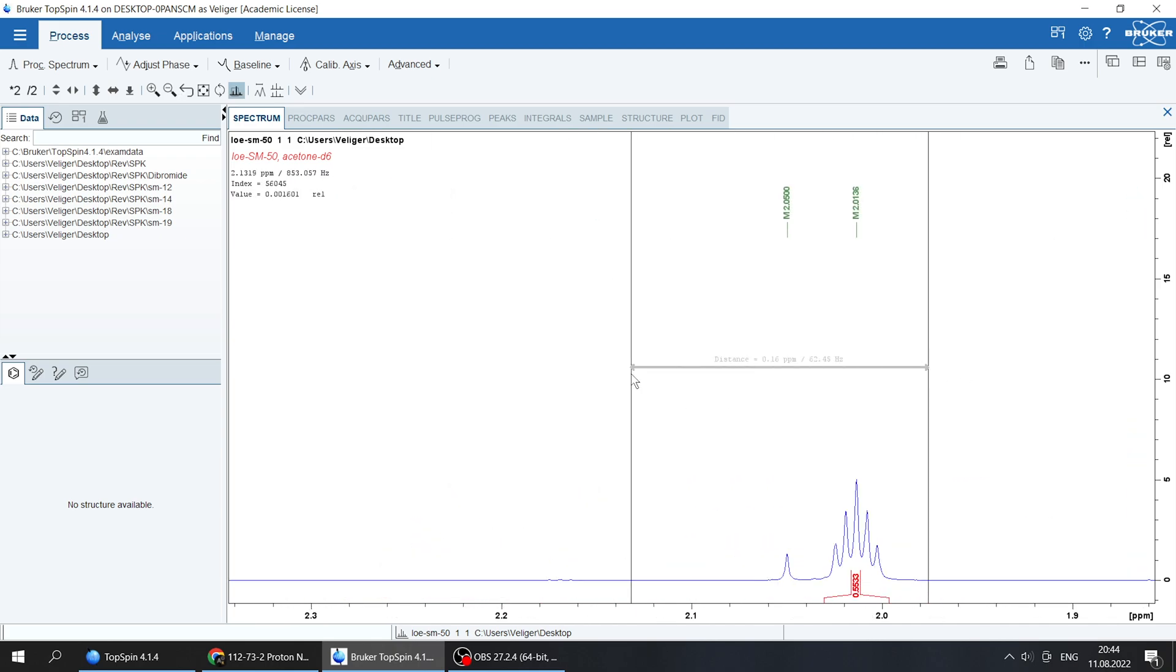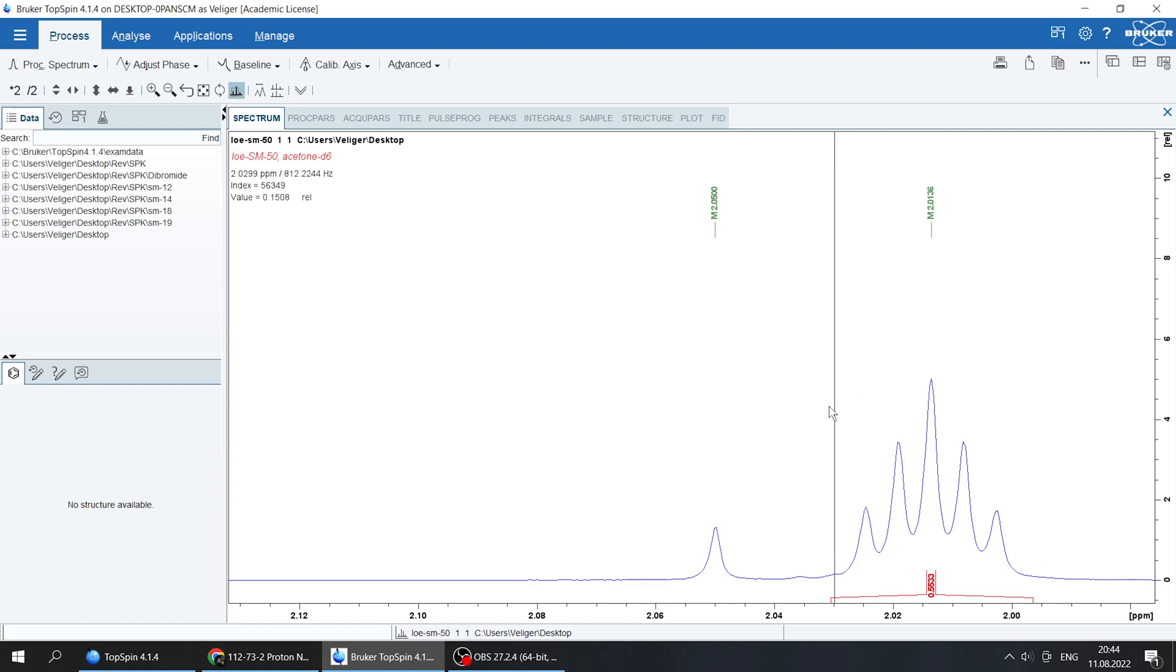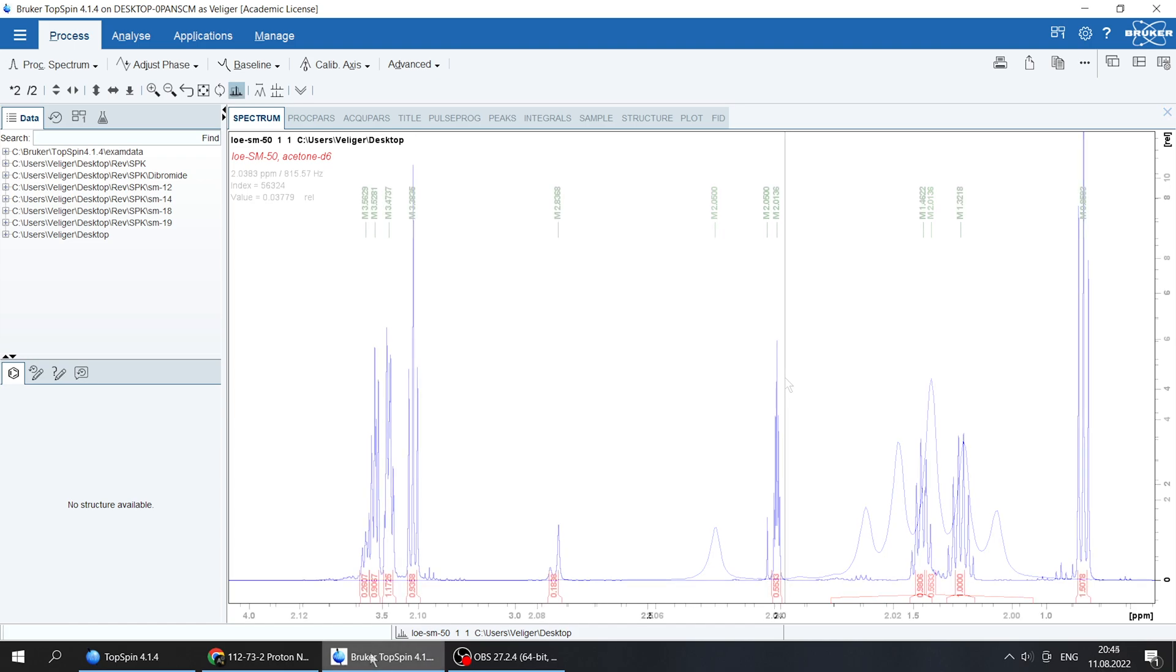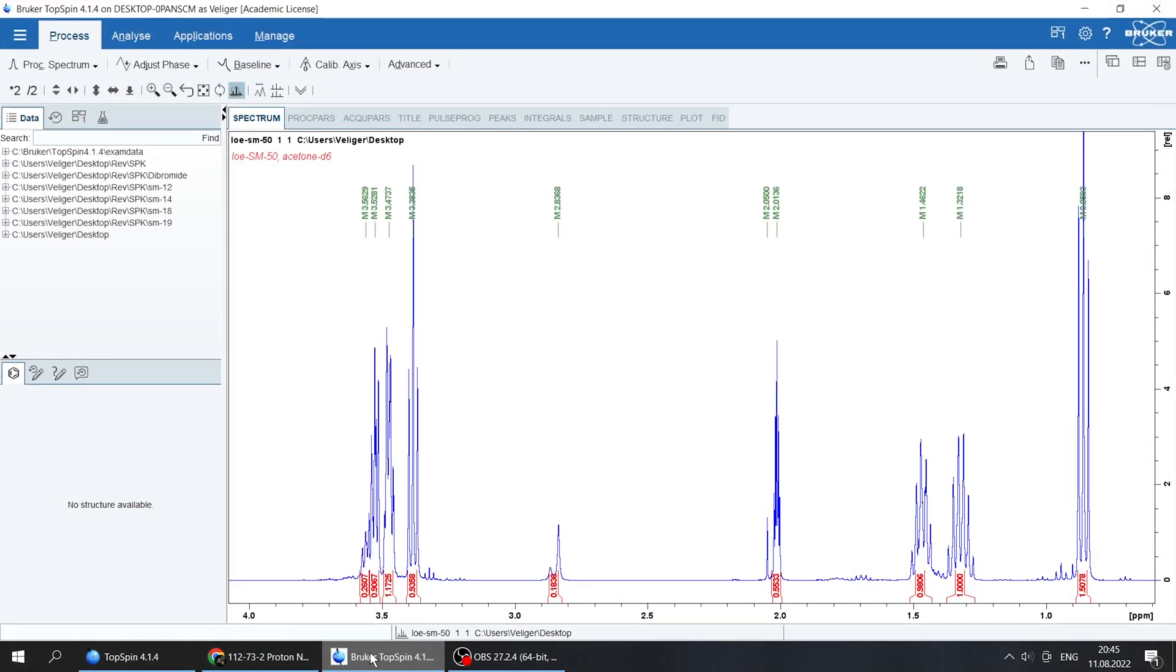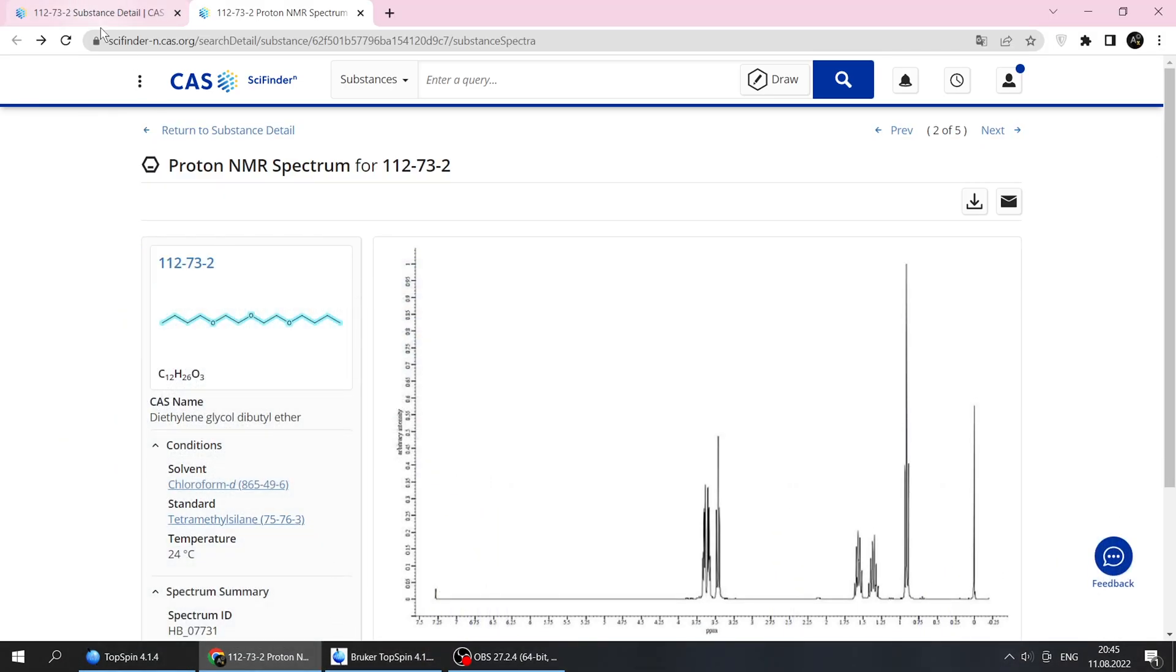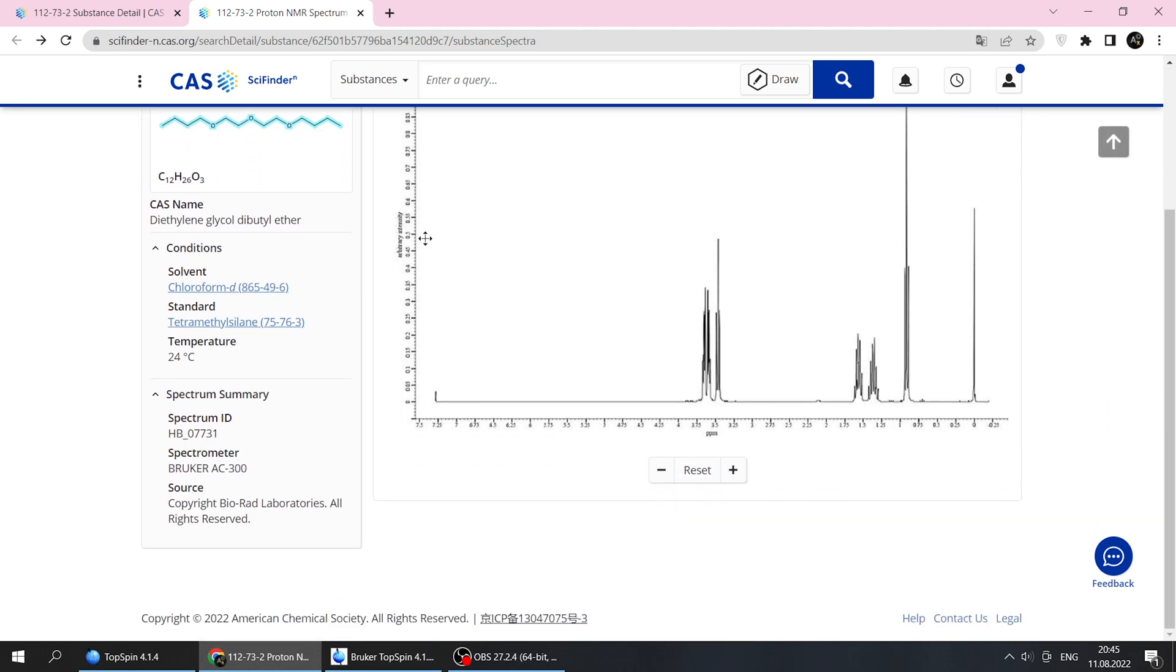Nevertheless, some impurities here. It's not a reagent, not ether, nor a monoester. I assume it came from a rotary evaporator nozzle or from the stir bar, because stuff we synthesize in our lab is pretty insoluble in anything and very hard to clean. Of course, DBD could be purified using vacuum distillation, but I have no reason to do it for such a small amount of product.